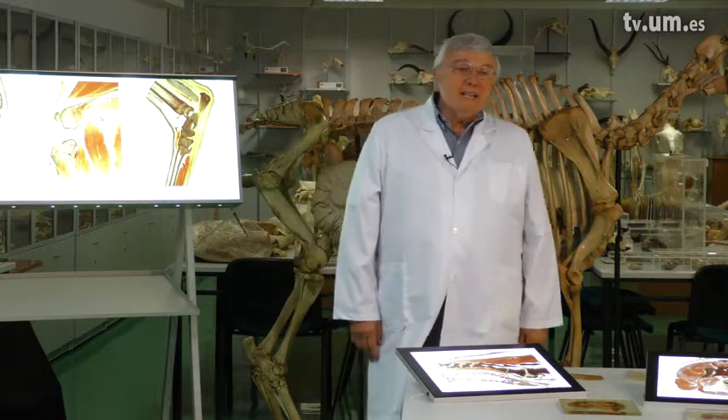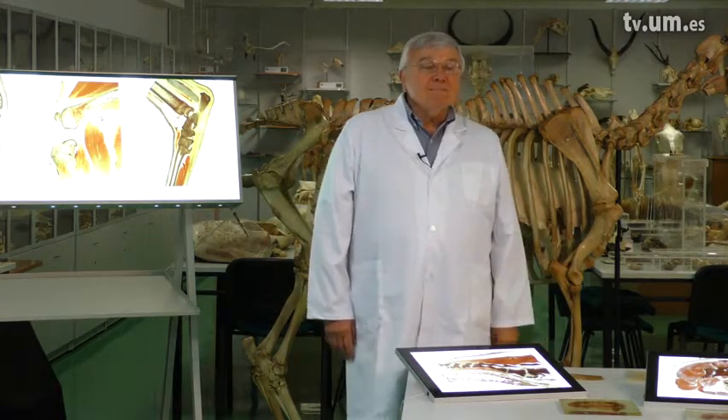This technique is to produce body slices. This is only the beginning. We strongly recommend that you take a course, a workshop on plastination to become a very proficient plastinator.